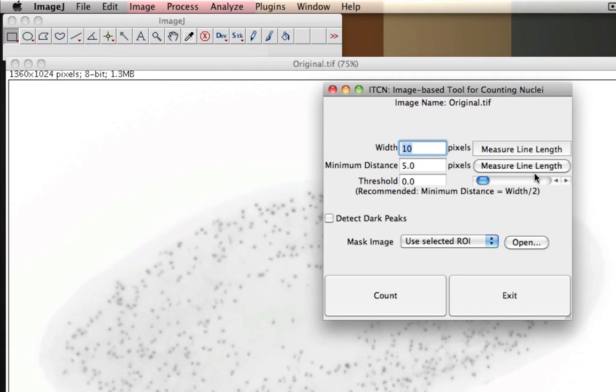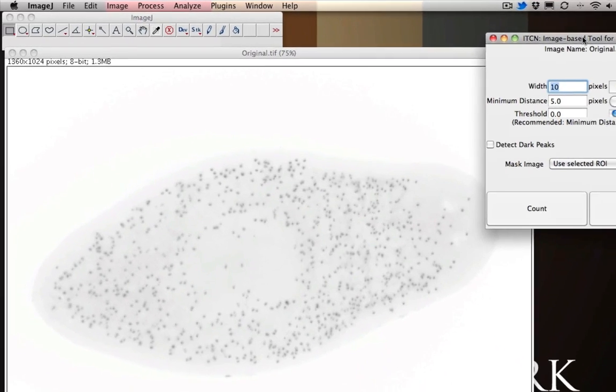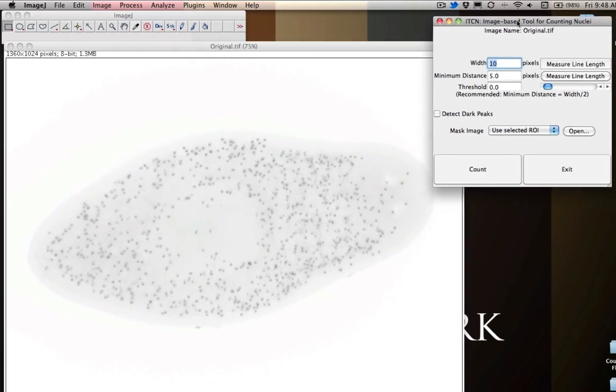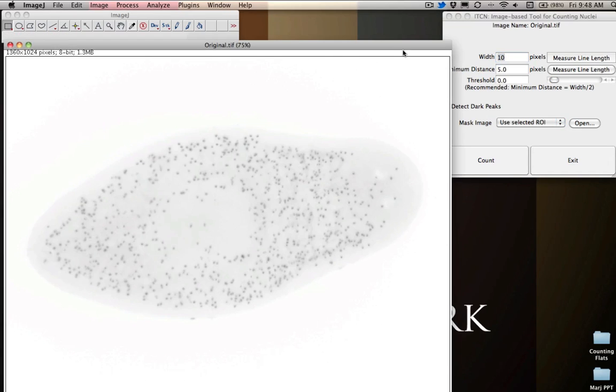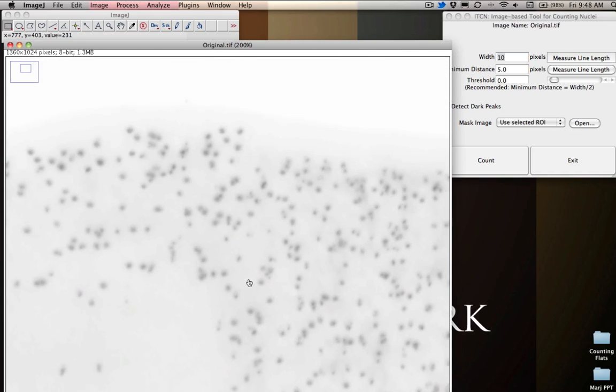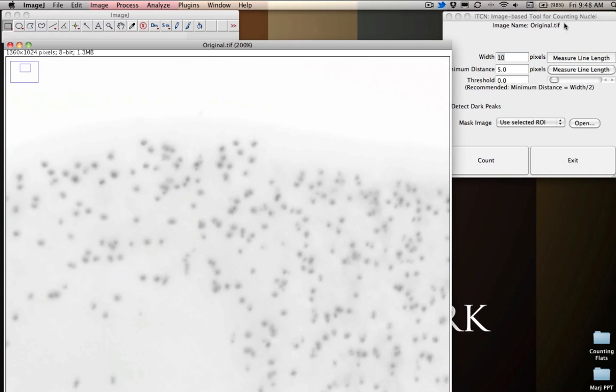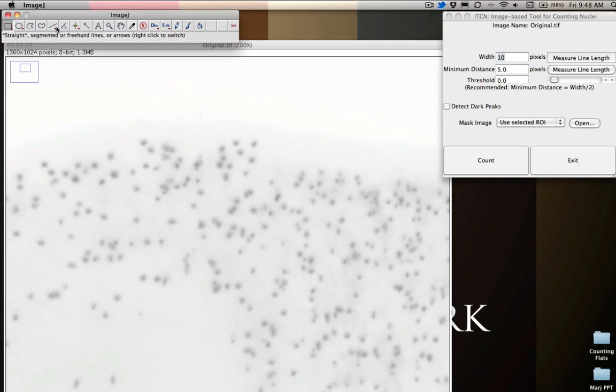We'll click on that. It'll open up this little window that's going to ask us a bunch of crazy questions, which might look like it's a little intimidating. Don't be intimidated or scared by this at all. It's all going to be okay. So the first thing this is doing right here is it wants us to give this tool an estimation for the width in terms of pixels for these different nuclei that we're trying to count.